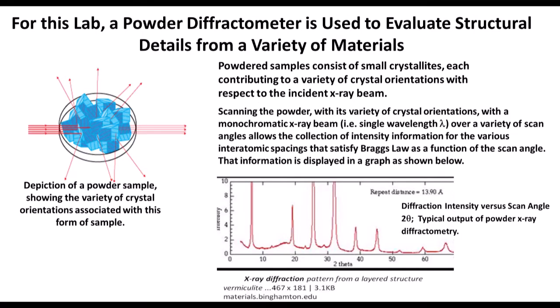law. In this lab, we will be using a specific technique of X-ray diffraction referred to as powder X-ray diffraction or powder XRD. We will use a powdered sample for the purpose of creating many small individual crystals so that on average, the X-ray beam interacts with the sample at every possible different orientation of the particular crystalline lattice.